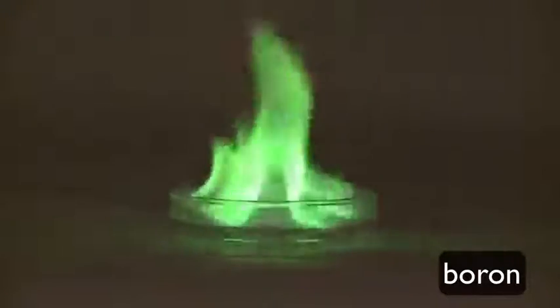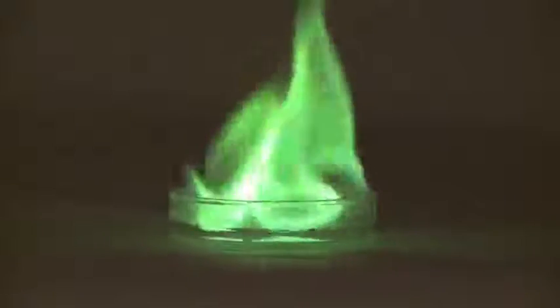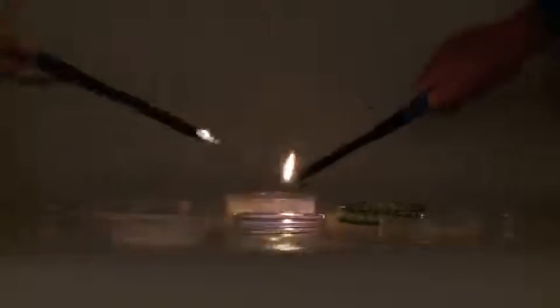Which of these colored flame solutions did you enjoy the most? For the grand finale, we've got all of the solutions burning at the same time. Dr. Lisle and I lit them as quickly as we could to make the most exciting campfire ever. The yellow-orange sodium is front and center.